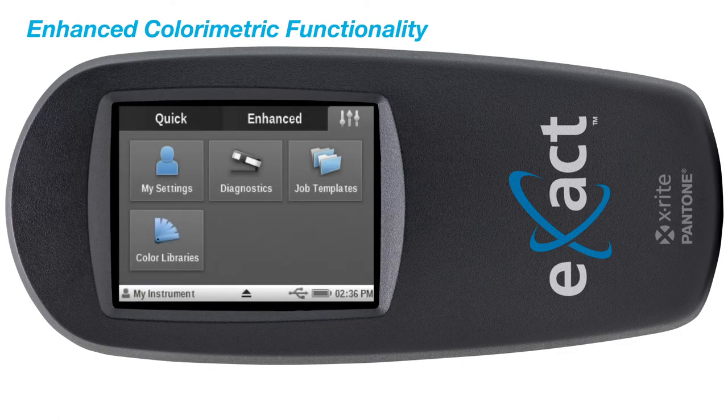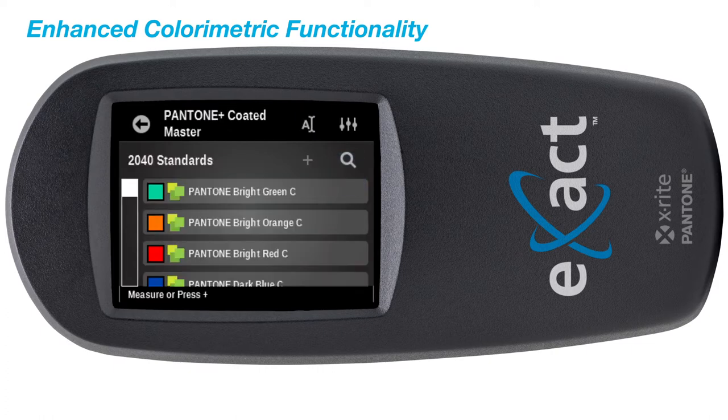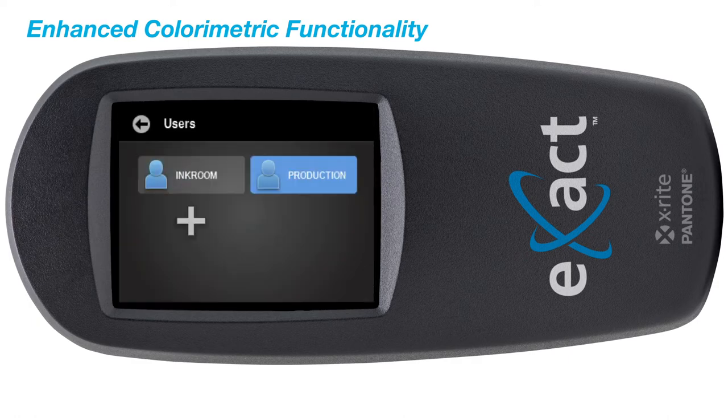It also provides seamless access to the latest Pantone libraries and Pantone Live digital color standards with a valid Pantone Live license for access to industry-leading color reference standards.